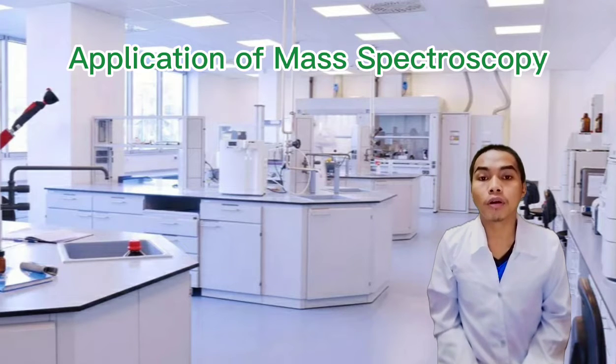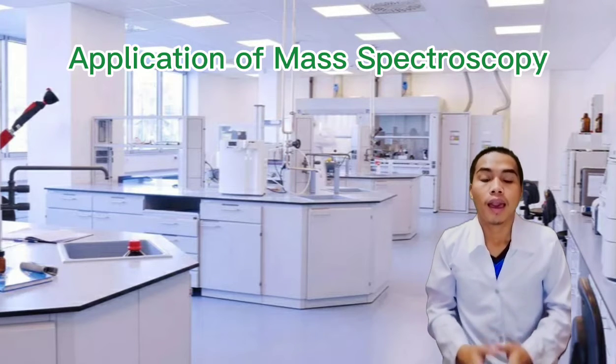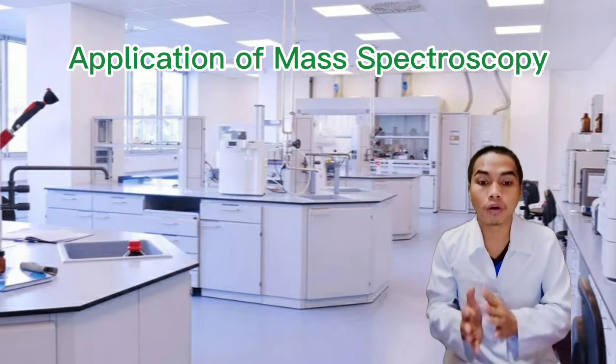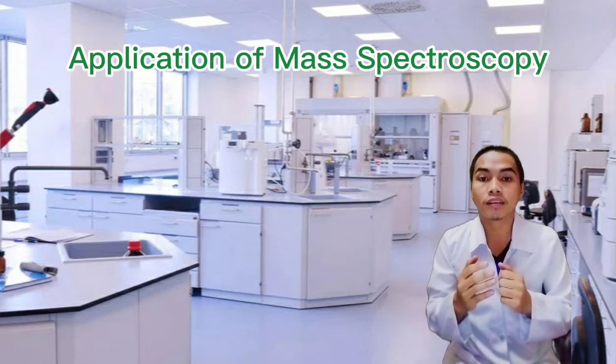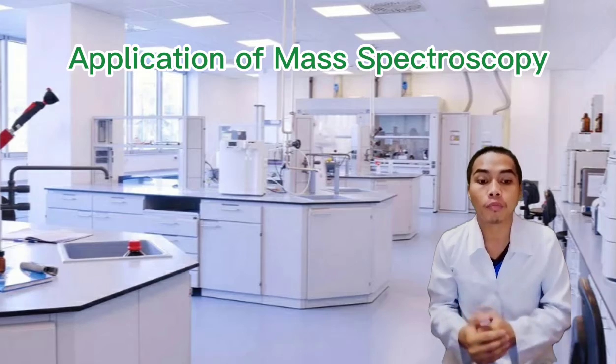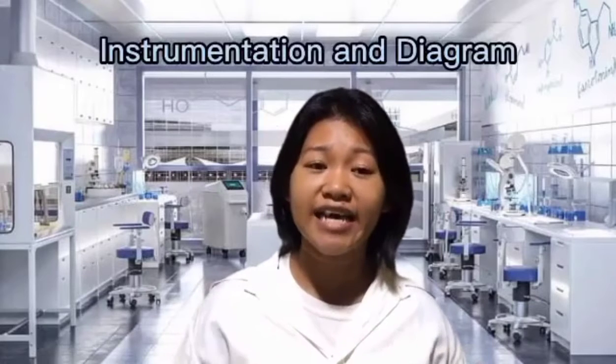In analytical laboratories that study the chemical, physical, and biological properties of substances, it is favored over several other analytical techniques, as it has less background interference since it is performed in a vacuum. Now let's proceed with the instrumentation and diagram.